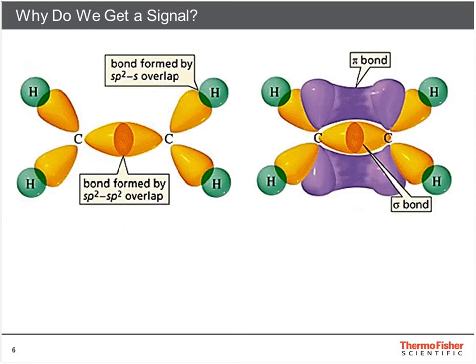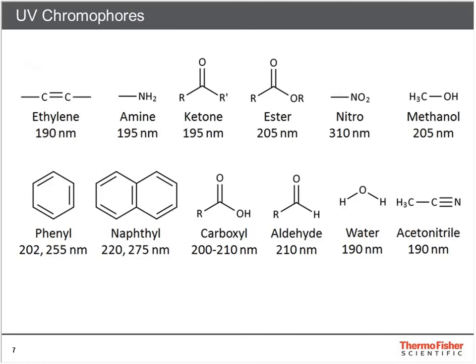Structures with double bonds often absorb UV light due to the presence of pi electrons. Heteroatoms having non-bonding valence shell electron pairs also absorb UV light. Conjugated systems are particularly useful in spectroscopy. This is usually a series of single and double bonds. About 200 nanometers, excitation of electrons from the pi, n, and sigma orbitals, and especially conjugated systems, produce informative spectra. This is a list of what wavelengths different bonds absorb.